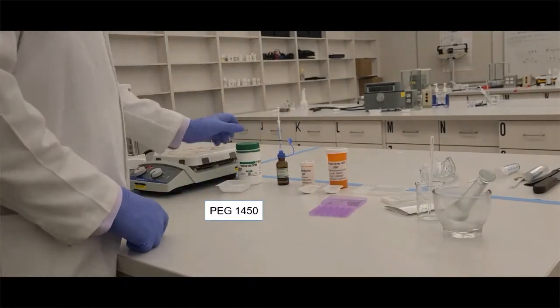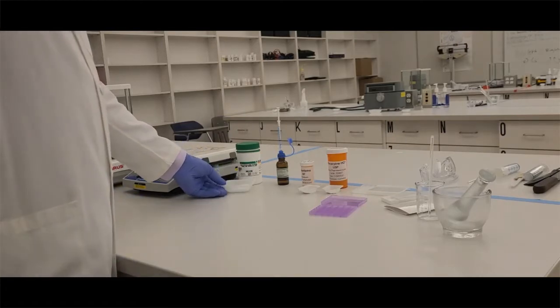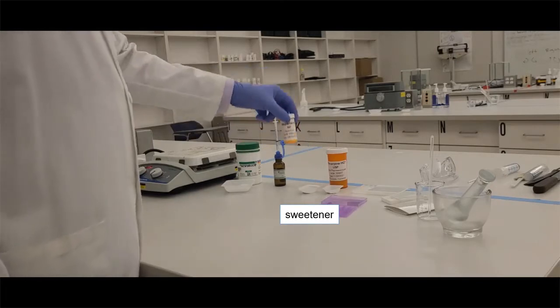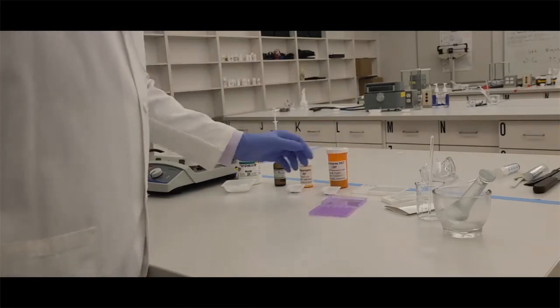The ingredients we're going to be using is the PEG-1450 as our troche base that will dissolve in the mouth. It's a very flaky, waxy substance. We have our flavoring agent that's liquid. We're going to use a sweetener, in our case aspartame, and our drug is going to be pilocarpine.